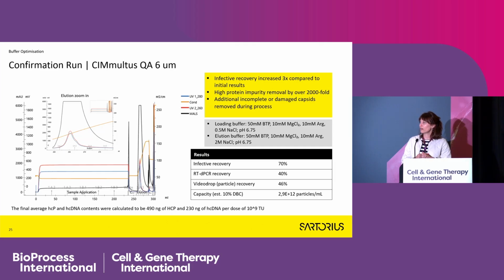Immediately when the lentivirus is eluted from the column, we dilute it to reduce the salt concentration, and we noticed that the ideal final conductivity was around 20 millisiemens. So this was the conductivity we wanted to reach when diluting the final fraction, and in such condition, we froze the material. Okay. And for feeding sample, is it dilution of the harvest or something? In the beginning, yes. So we dilute the harvest to really meet the binding conditions.